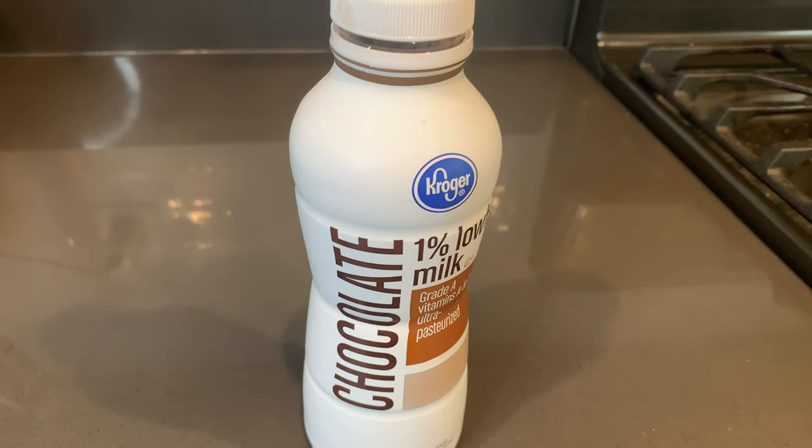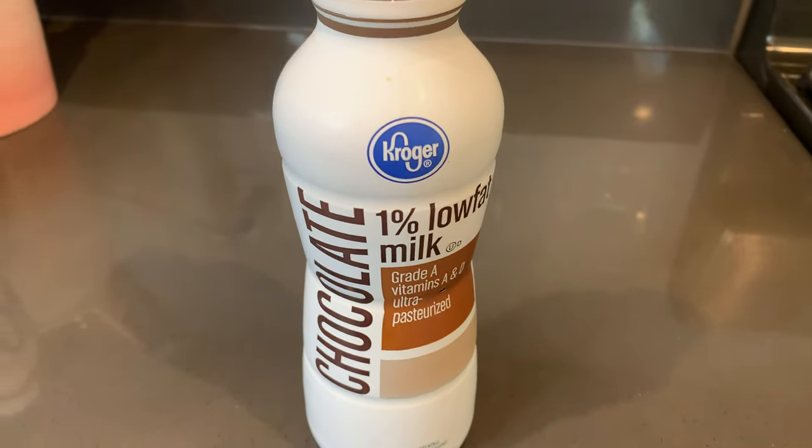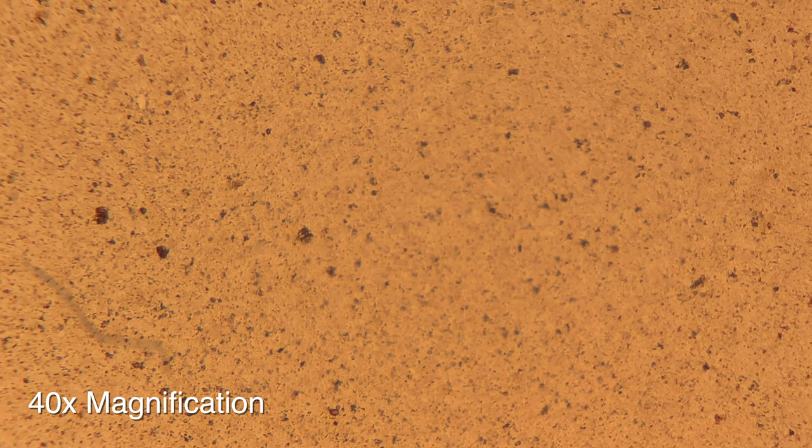Let's finish up our cow products by looking at my personal favorite, chocolate milk. As you can see, this one is very different. There are a lot of scraps of chocolate particles all over the place, and all of these chocolate scraps are a lot bigger than the fat globules that we were seeing.